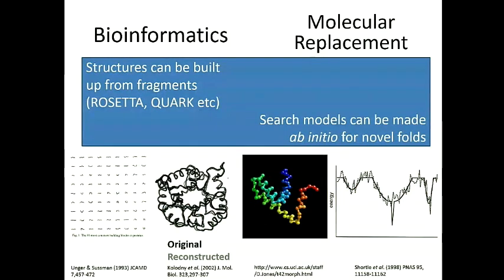So this talk fits quite nicely into the topic of this meeting, the integrative and rational molecular replacement, because AMPLE is all about integrating bioinformatics developments and making them useful, translating them to structural biology so that it's useful to you as a crystallographer. So there's going to be 3 slides introducing the 3 little sections and explaining a bit of the bioinformatics behind the 3 ideas.